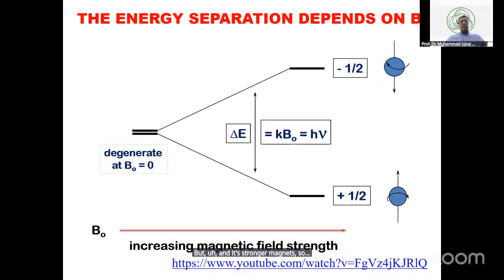Initially permanent magnets, then electromagnets, and finally superconducting magnets were developed. As a result, B naught was larger and larger, and when B naught is larger, the energy difference is higher. When the energy difference is higher, the population difference is relatively better.